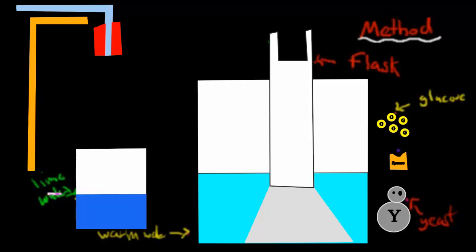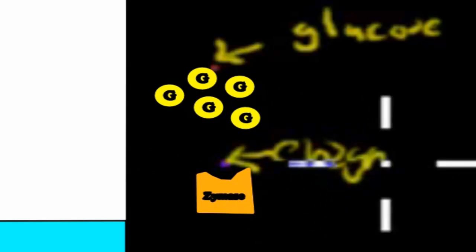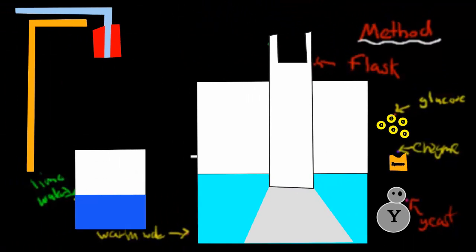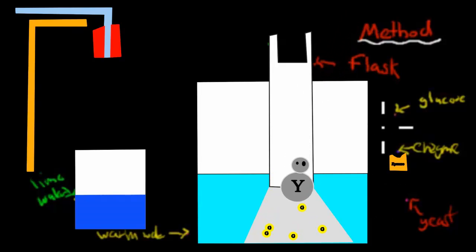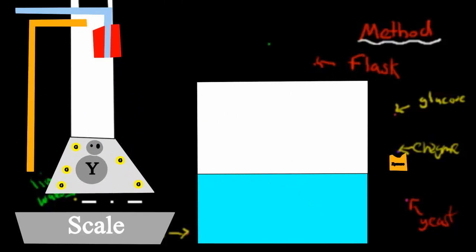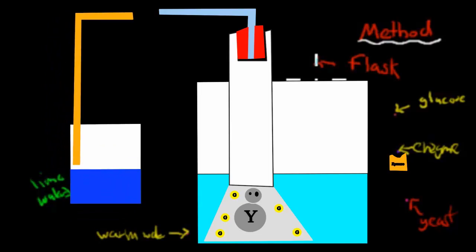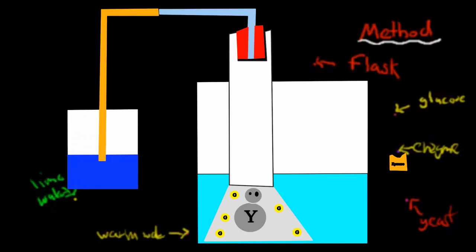This here is our enzyme. So this enzyme will be produced by the yeast, it's actually going to come from the yeast itself. What we have to do first is put the glucose and the yeast into our flask. Before we start, we want to make sure we actually weigh the flask. Because to monitor changes, we need to know how much it weighs beforehand and afterwards. Once we've weighed it, we put it back in. Make sure you don't forget to put the stopper on. The stopper makes sure there is no oxygen that comes in.